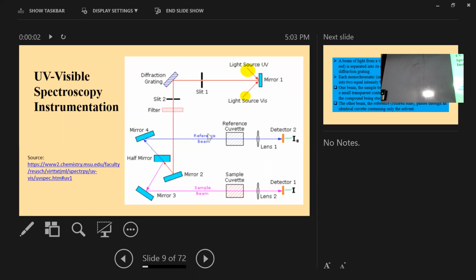That means less light is being absorbed. If you have more sample, that means a thicker sample or more amount of sample, it will absorb more light and you will get less light at the detector. So as we increase the sample, we absorb more light. That means absorbance will be high and transmittance will be less. So that is the formula we are going to learn, to determine the concentration of any sample.